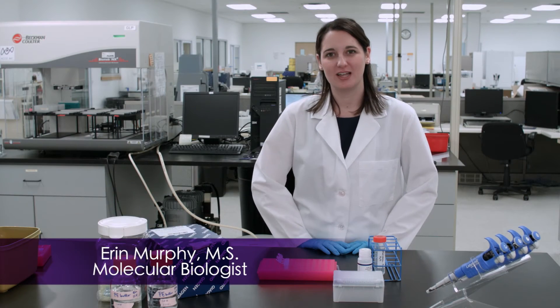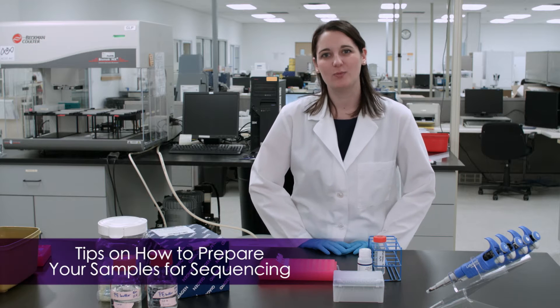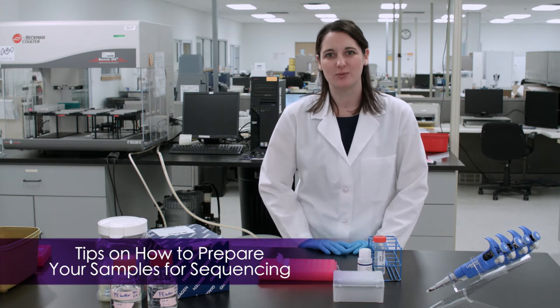Hi, my name is Erin. I'm one of the molecular biologists here at ACGT. Today we are going to discuss how to prepare your samples in order to get optimal sequencing results.